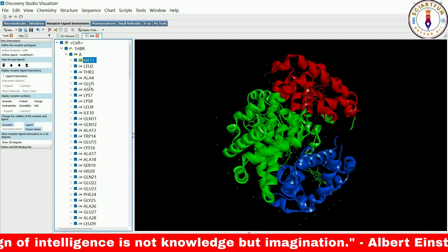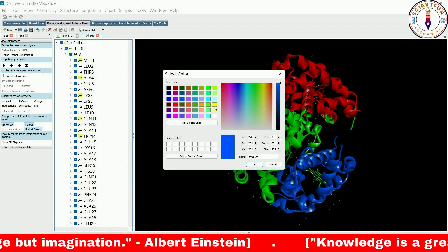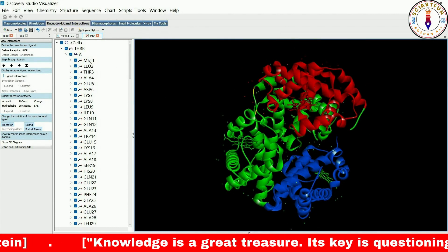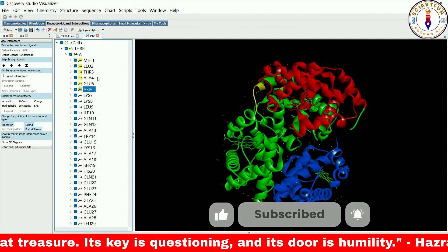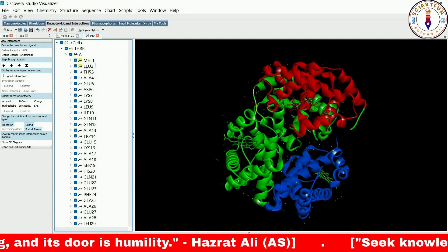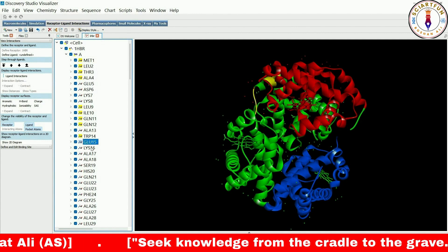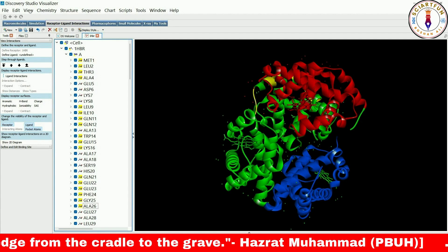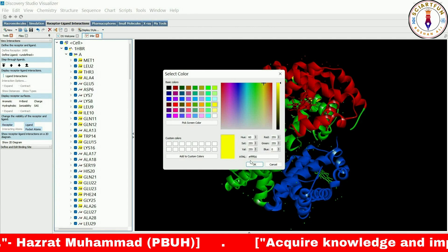You can also change the color of selected residues by first selecting the desired residues and then changing their color. This is a useful tool for highlighting specific regions of a protein or for differentiating between different types of residues. For example, you may want to highlight residues that are important for a particular function or interaction, or distinguish between different types of residues based on their chemical properties or structural features.